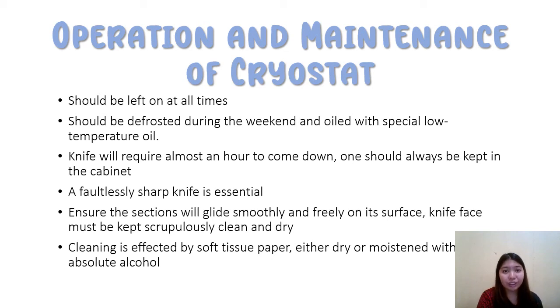In order to achieve the best result for the pathologists, a faultlessly sharp knife is essential for cryostat sectioning. To ensure the sections will glide smoothly and freely on its surface, the knife face must be kept scrupulously clean and dried. The same applies to the undersurface and edge of the anti-roll plate. Cleaning is effected by soft tissue paper, either dry or moistened with absolute alcohol.